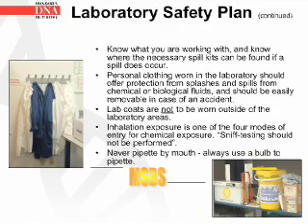Personal clothing worn in the laboratory should offer protection from splashes and spills from chemical or biological fluids, and should be easily removable in case of an accident. Lab coats are not to be worn outside of the laboratory areas. Inhalation exposure is one of the 4 modes of entry for chemical exposure. Sniff testing should not be performed, and never pipette by mouth. Always use a bulb to pipette.